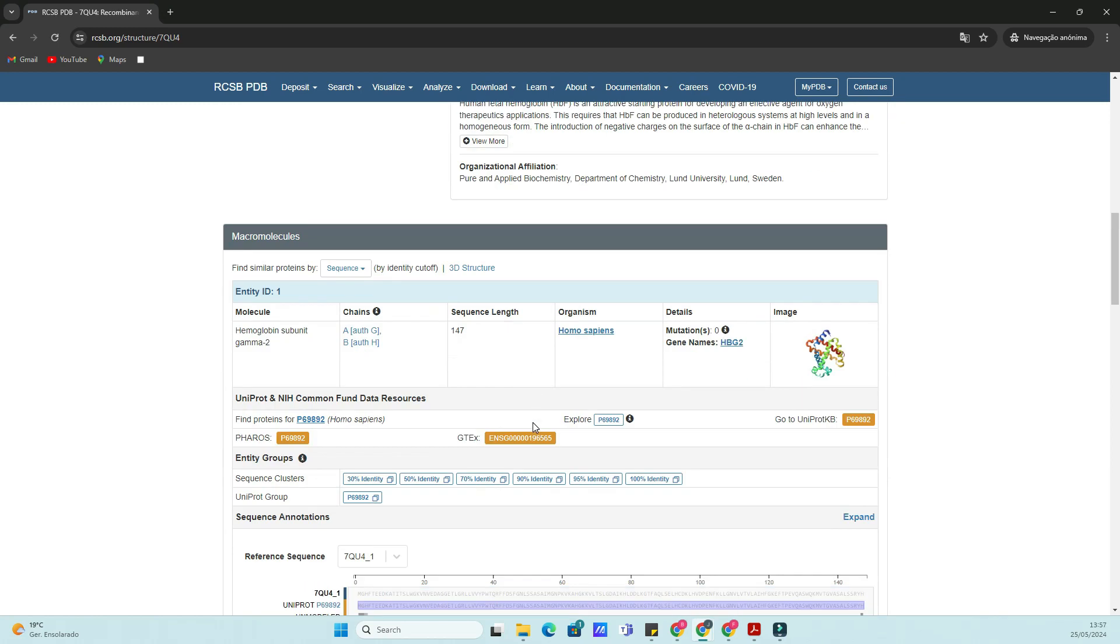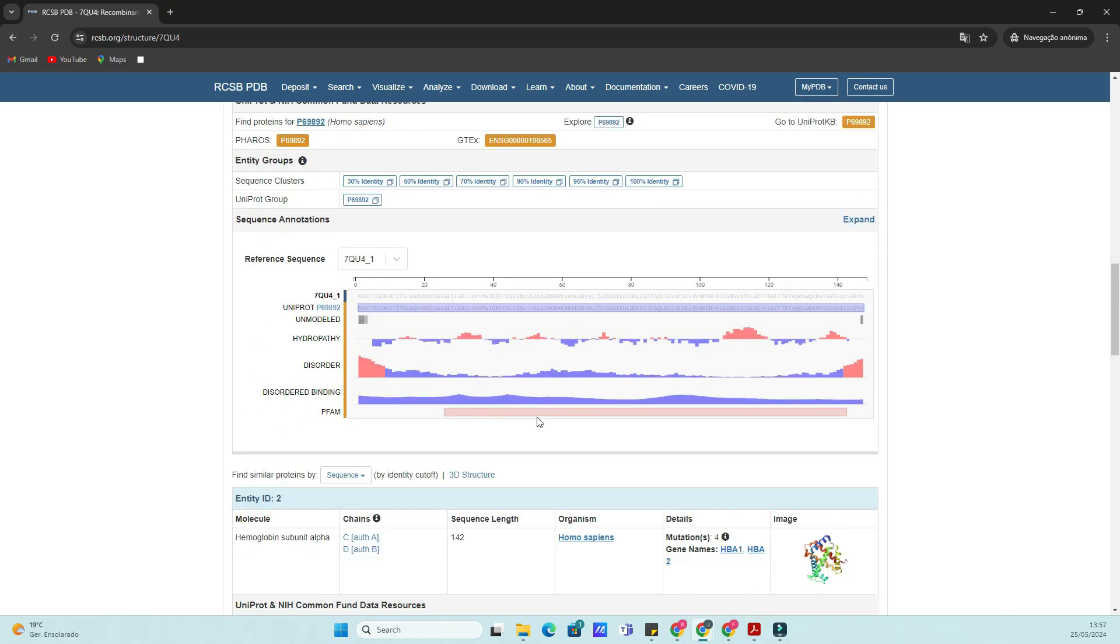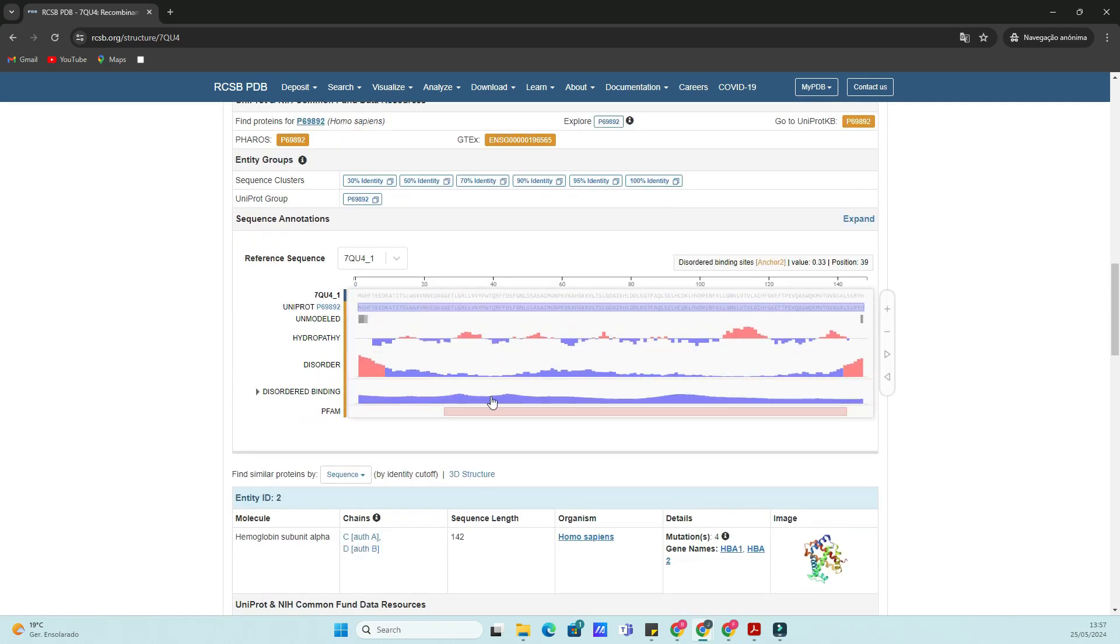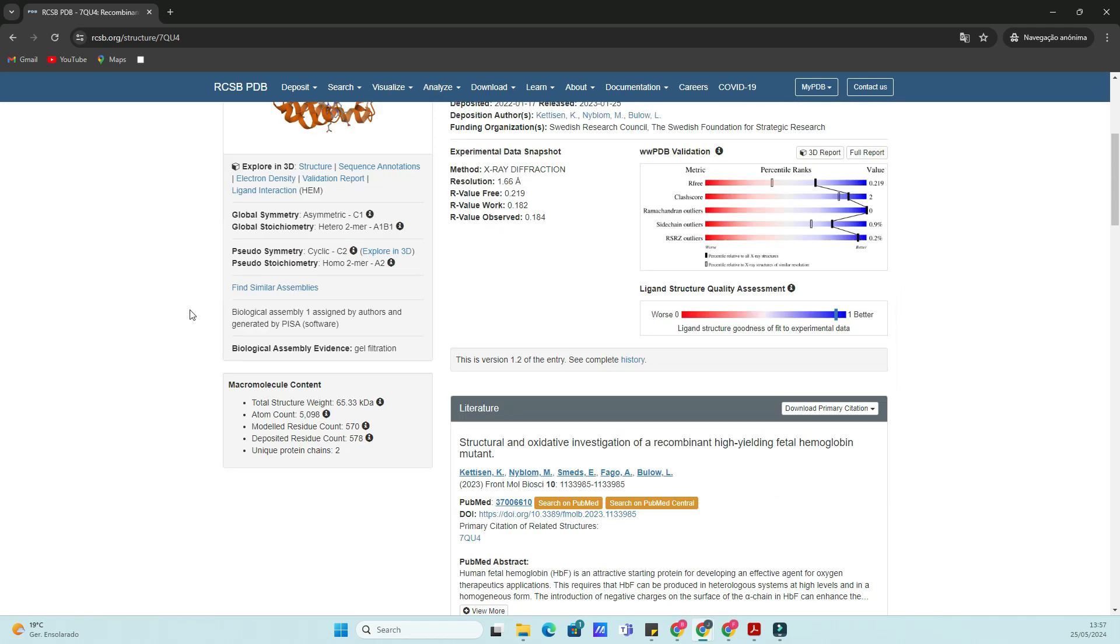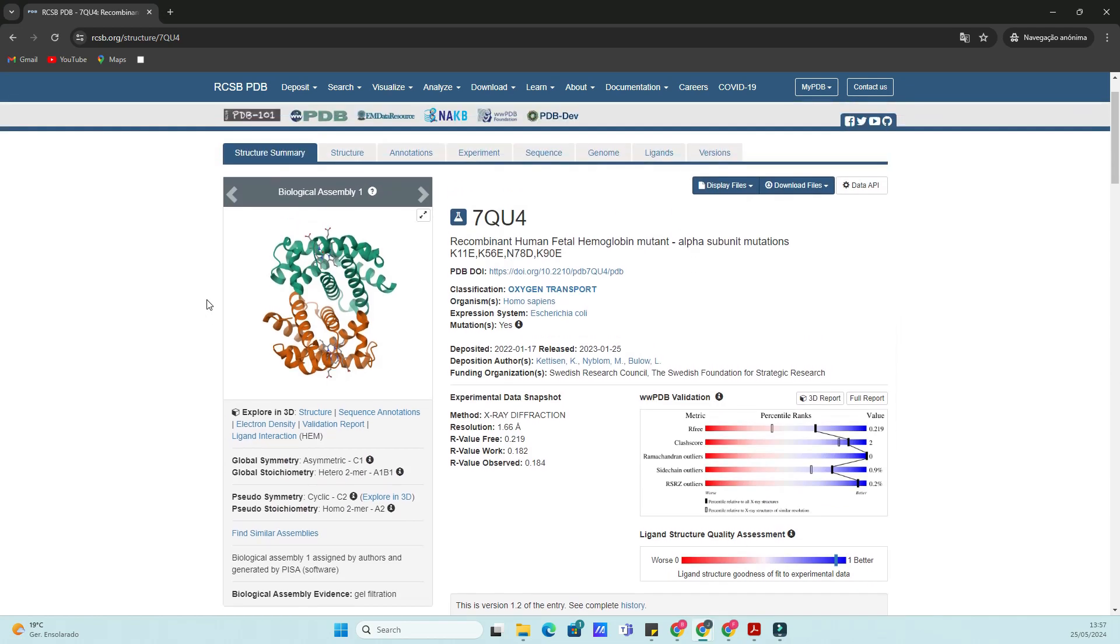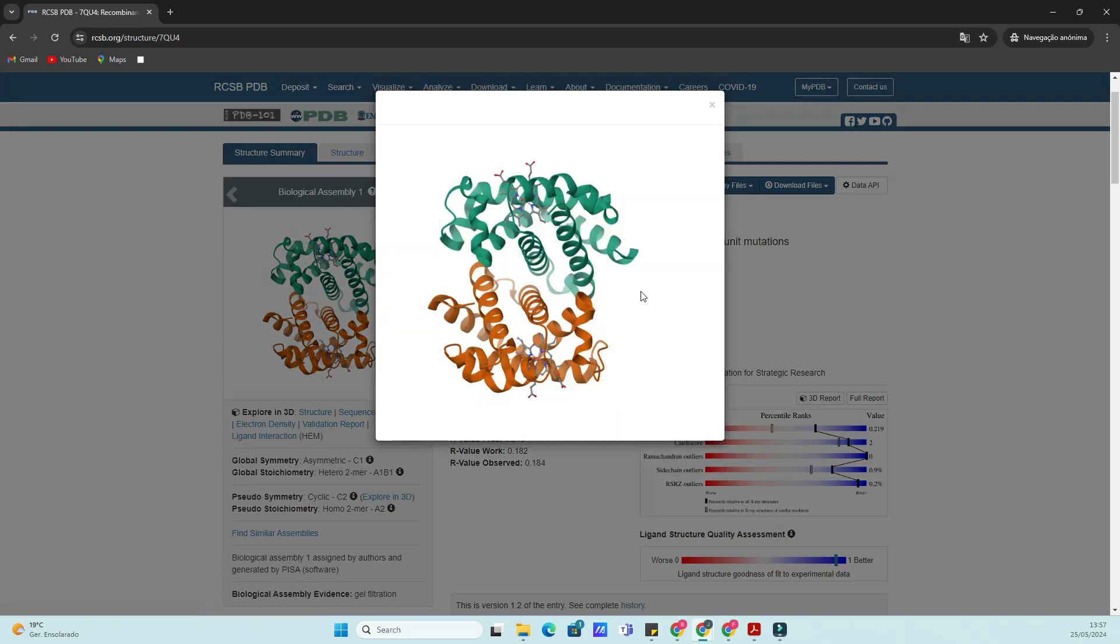Let's add Homo sapiens as a filter. You'll see a list of search results. Each entry represents a different structure of hemoglobin that has been deposited in the PDB. Let's click on the first result.